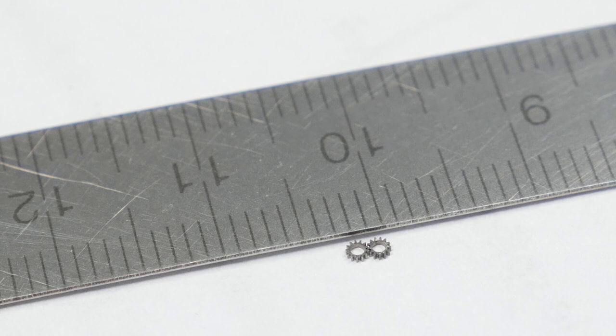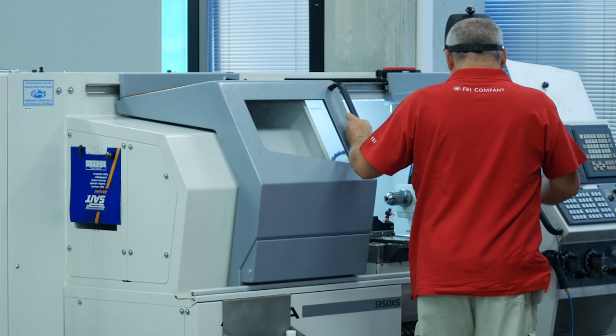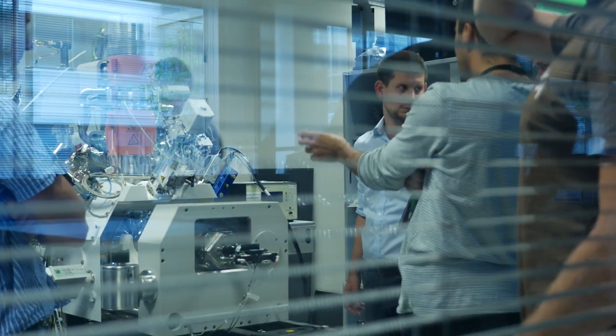These are incredibly tiny parts. I would like to see such a small lathe. You are right. Some of the parts are so small that they cannot be machined, and prototypes are produced by different technologies, for example, etching into material. Well, that makes sense. When the mechanical part of a new device is finished, assembly and long-term reliability tests start. It is the time to engage other members of the development team to implement electronics and bring the microscope to life with software.